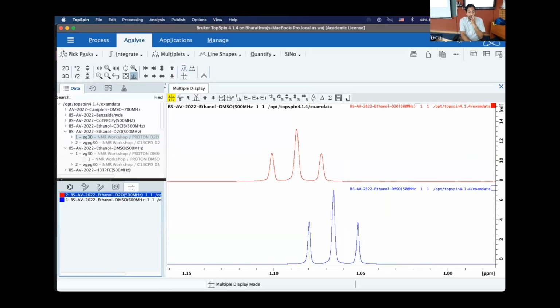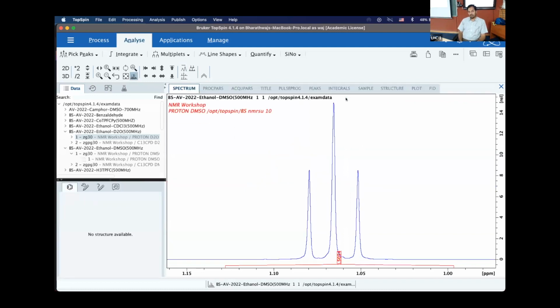I'm just giving you an idea how NMR data could be interpreted to understand how the molecule is behaving. And we took a simple molecule, ethanol, which is very well known for so many decades now, centuries actually, right? Taking a simple technique, making one measurement, how do things change?